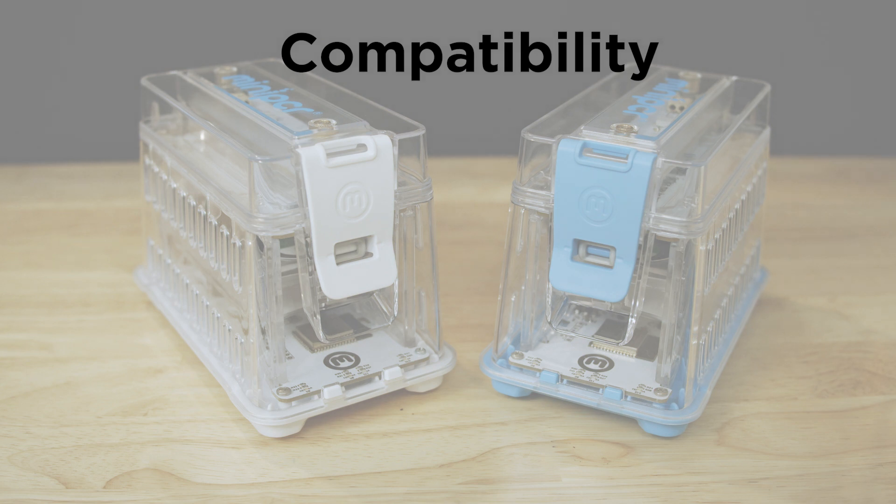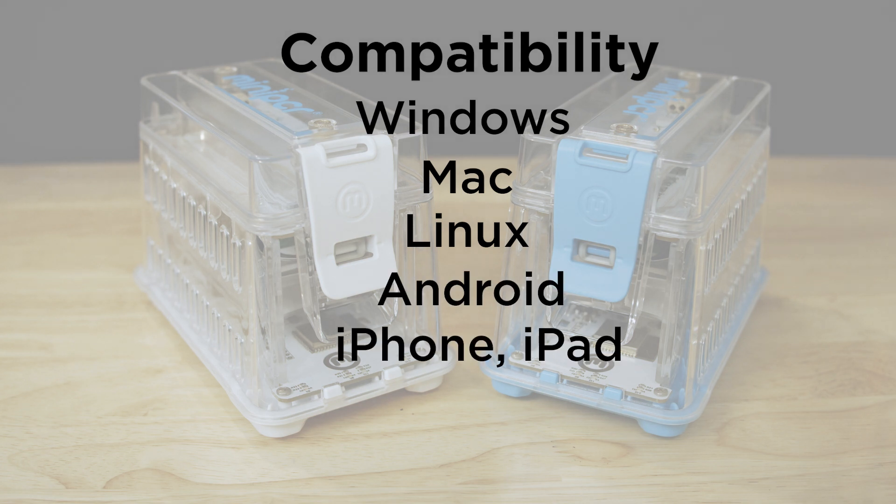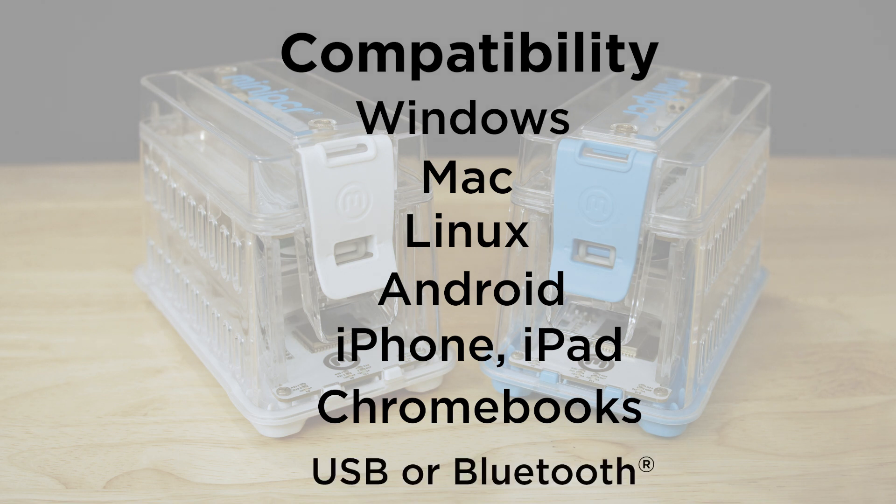Both the Mini-8X and Mini-16X are compatible with Windows, Mac, Linux, Android, iPhones and iPads, and Chromebooks with access to the Google Play Store. Devices may be connected via USB or Bluetooth.